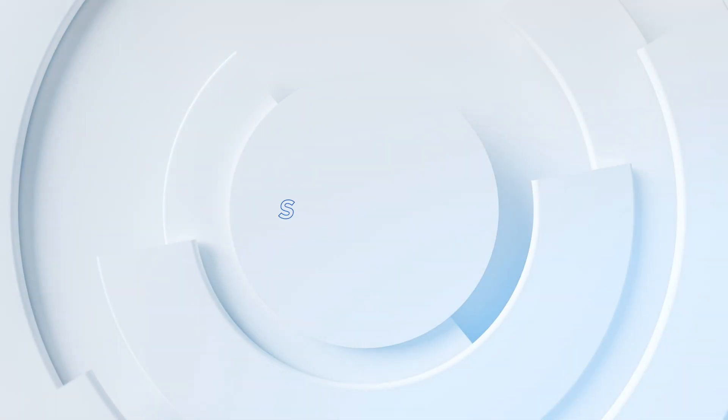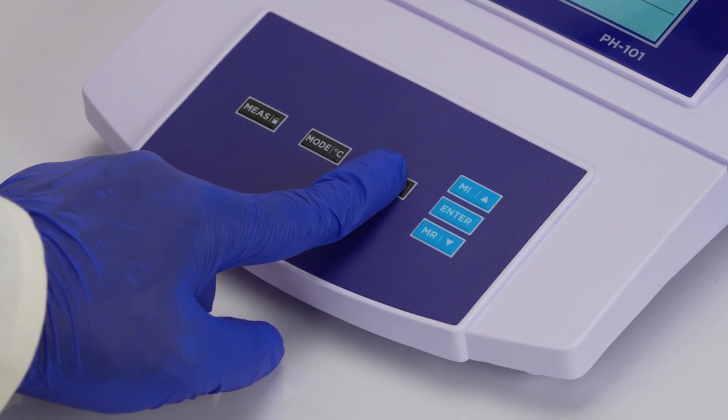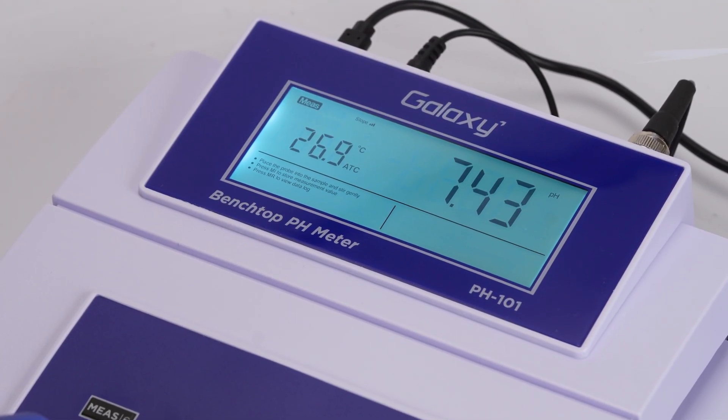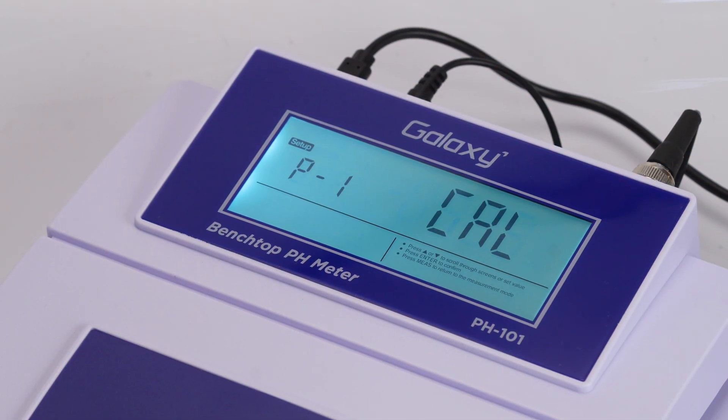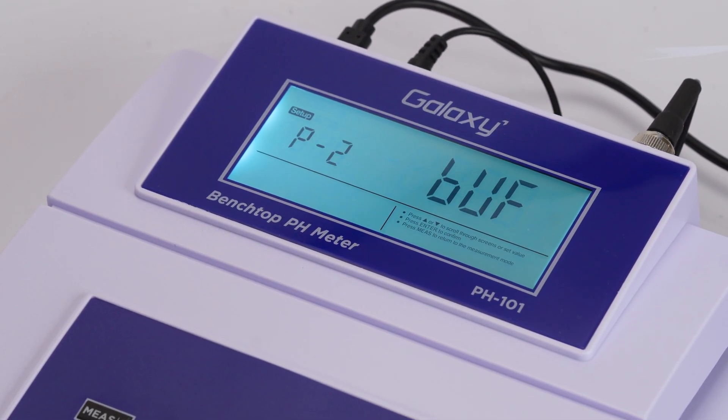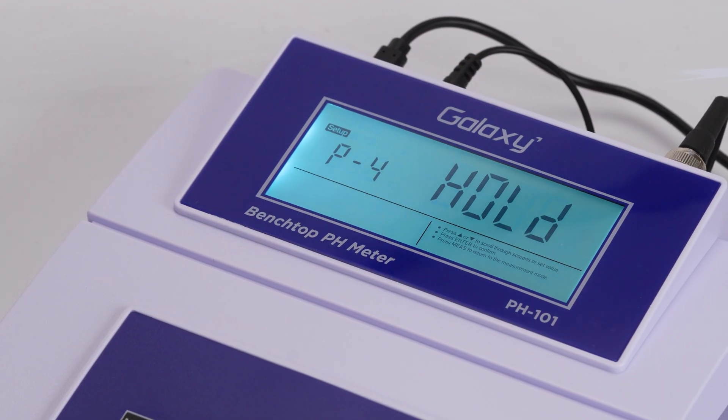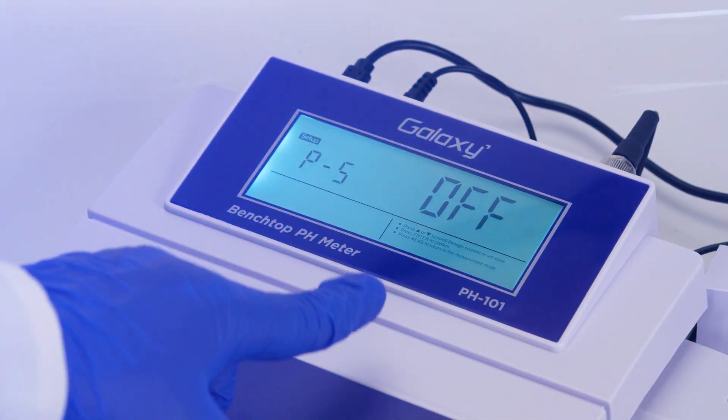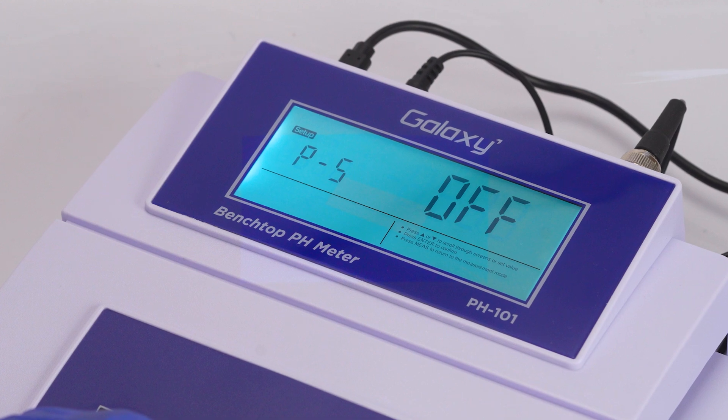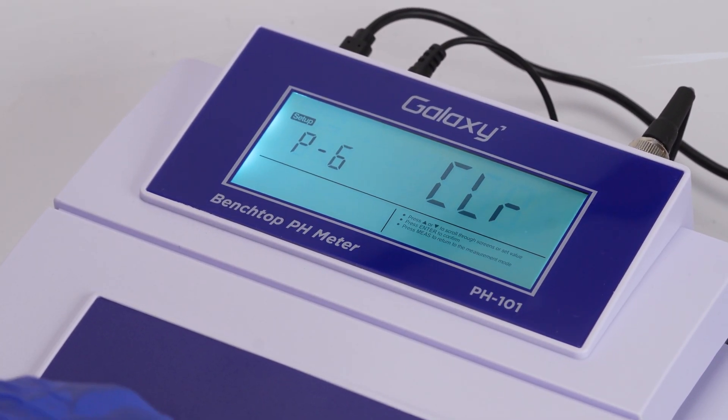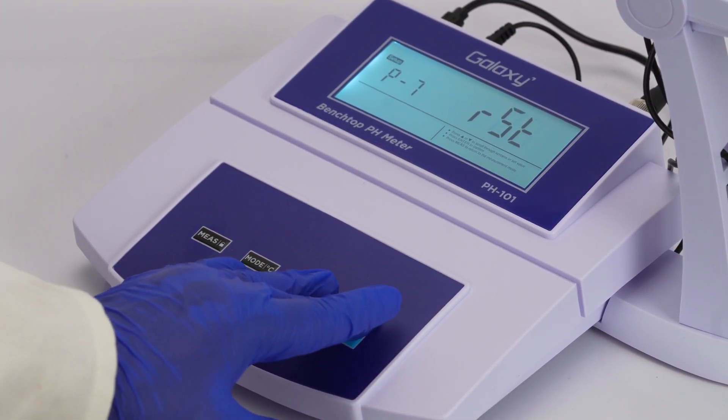To access the setup menu, press and hold the cal key. From there you can choose cal to configure calibration points, buff to set the pH buffer group for calibration and auto recognition, unit to select the measurement unit, hold for automatic endpoint locking, off to enable power saving mode that switches off the device after 30 minutes of inactivity, and CLR to delete all data logs factory reset. Once you've made your selections, press enter to save them.